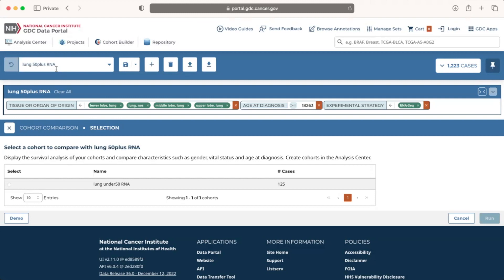The current active cohort consists of 50-plus year-old lung cancer cases with RNA-seq data, as shown in the Cohort Toolbar. In the Cohort Comparison Selection section below, we see a list of previously saved cohorts, including a cohort of under 50 lung cancer cases with RNA-seq data.